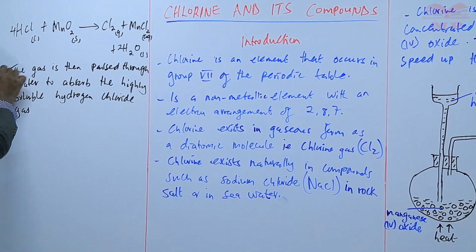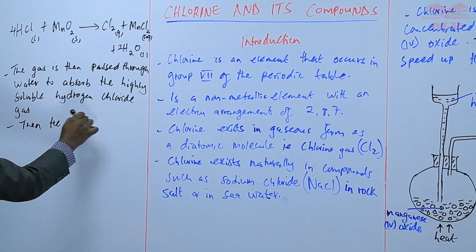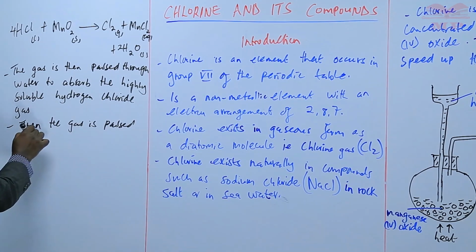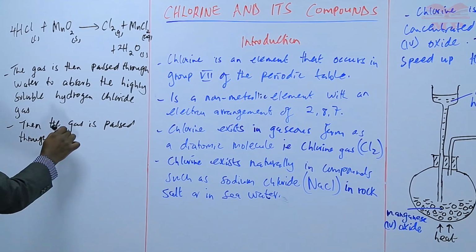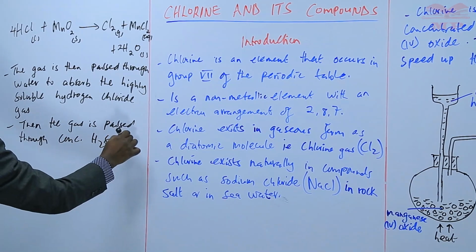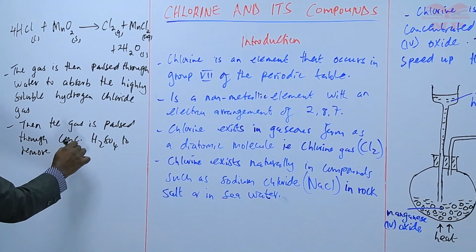And then the gas is passed through conc sulfuric acid to remove moisture or to dry the gas.